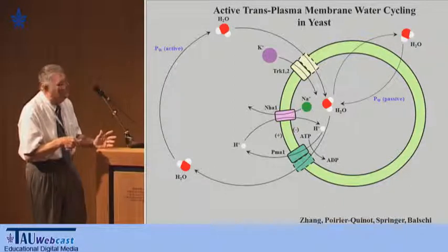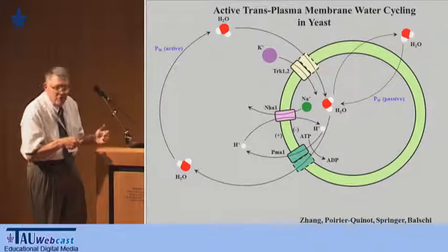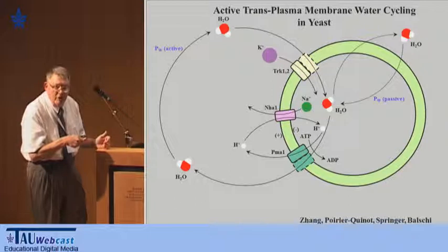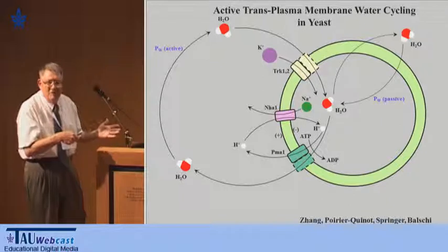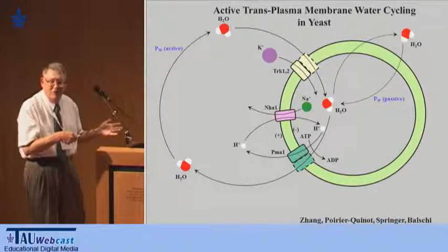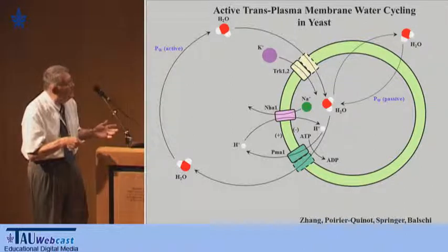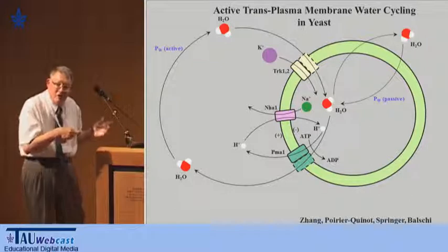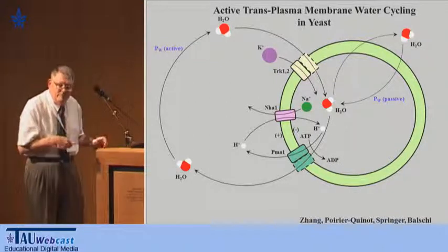It's a great question, but they're not enough. The protons that are the difference in protons between the two sides are used to create the membrane potential. And as you know, that's an exponential, so it's very, very tiny. I mean, pH is near 10 to the minus 7th concentration on each side. So in fact, it actually is water molecules, because in the heart, which we have data but I haven't shown you, it's not pumping protons, it's pumping sodium, and we see the same thing.